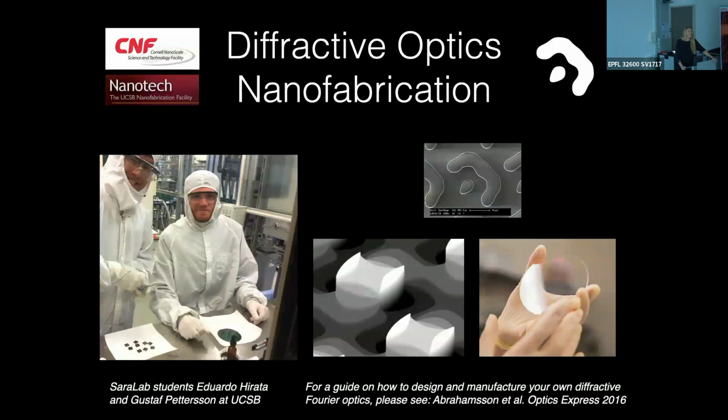And in a sense, it's easier than refractive optics, because if you want to make, for example, microscope objectives, they're made in Germany and in Japan. So even France, which is a great optics nation, you don't have that. Even the US, which is a big science nation, doesn't have that. But diffractive optics, you can learn to make hands-on. It may take a couple of years. It took a couple of years for me, but it's really, really fun.